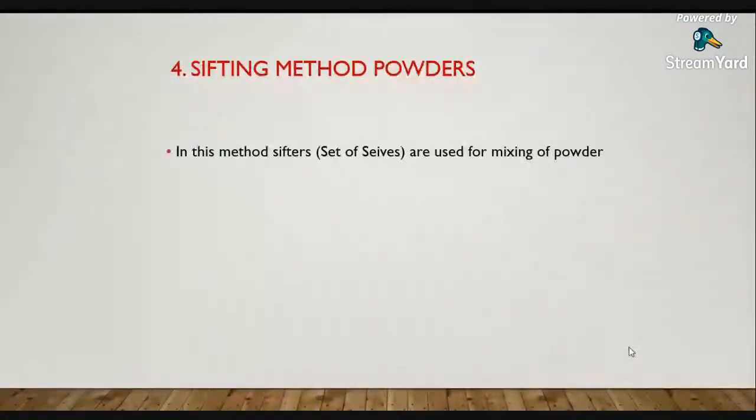One benefit of this process is that if the powder contains large size particles, they get easily separated out. This is the sifting method.